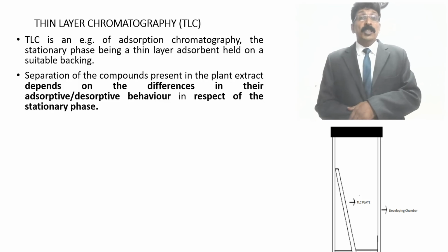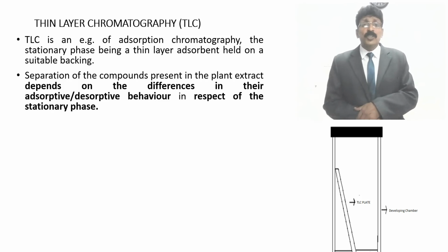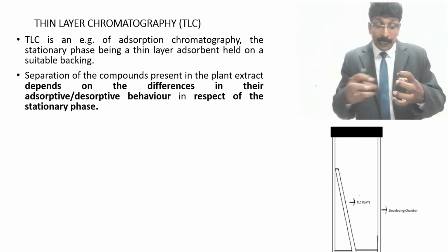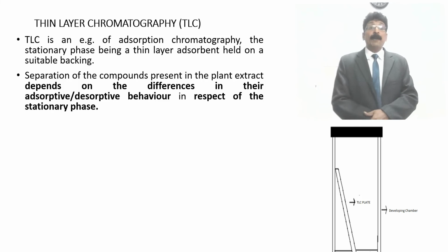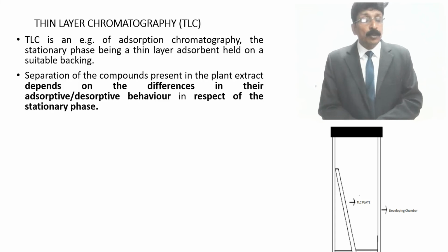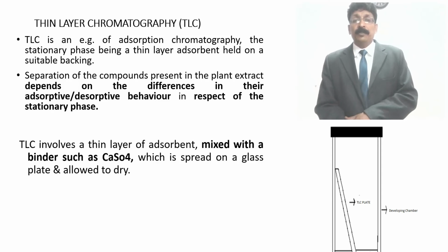Separation of compounds present in a plant extract depends on the difference in their adsorptive affinity, adsorptive and desorptive behavior, with respect to the stationary phase. So that's a very important point which we should note down.